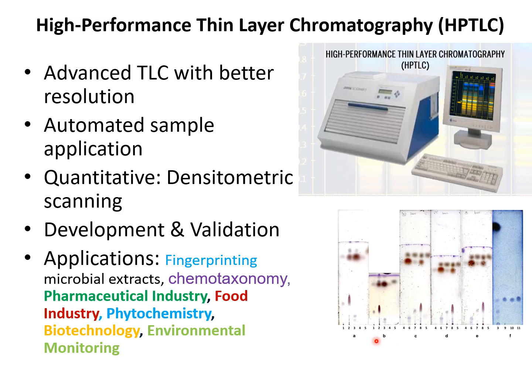So this allows researchers to quickly assess similarities and differences between microbial strains. For example, if these are microorganisms, based on this fingerprint, it can be seen that some of these microorganisms share some similarities and differences.